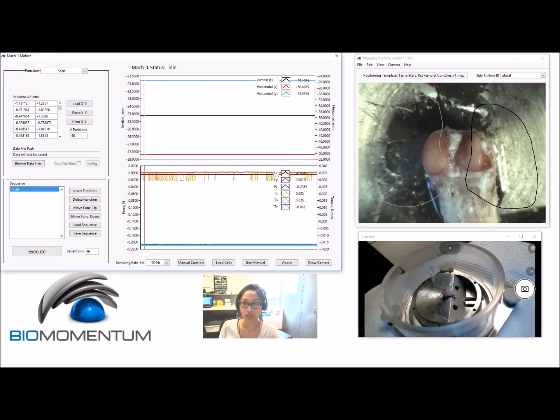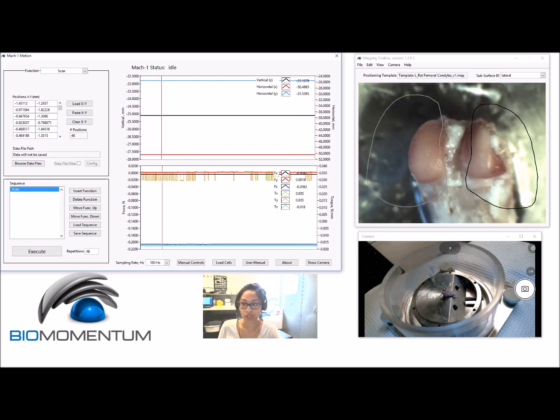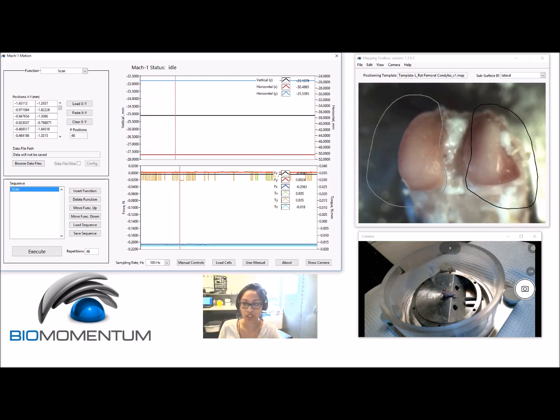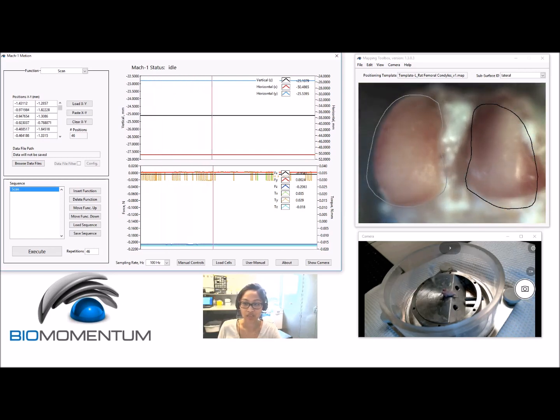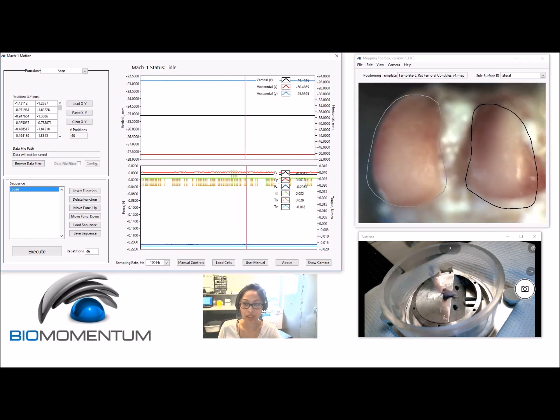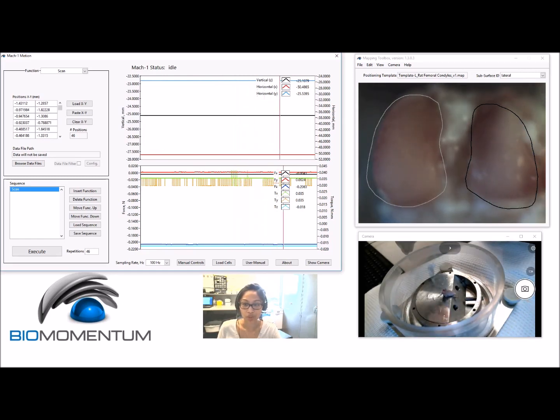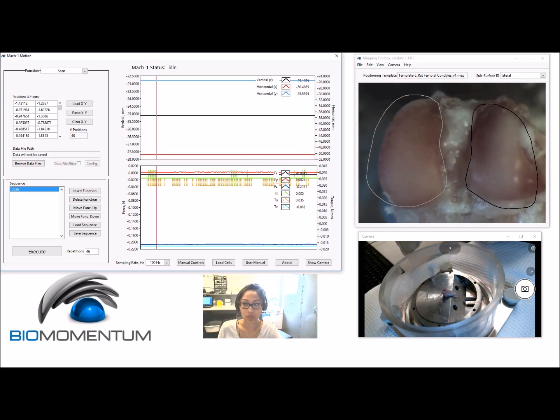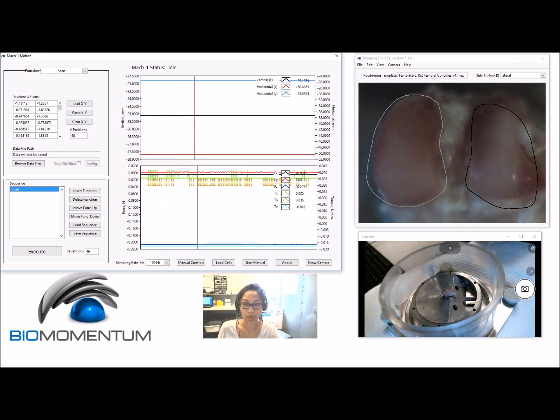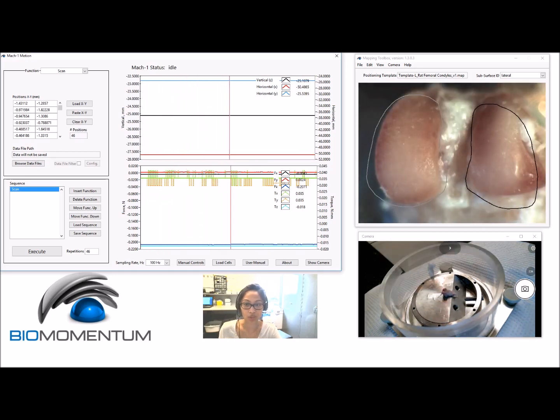It is recommended to use an appropriate surface positioning template to facilitate eventual mapping comparison between samples. Adjust the position of the camera and its focus so that the sample's surface boundaries fit those of the surface positioning template.